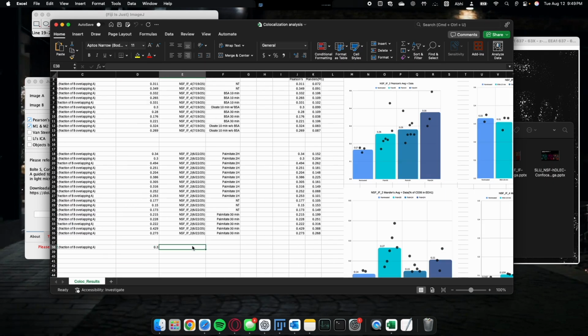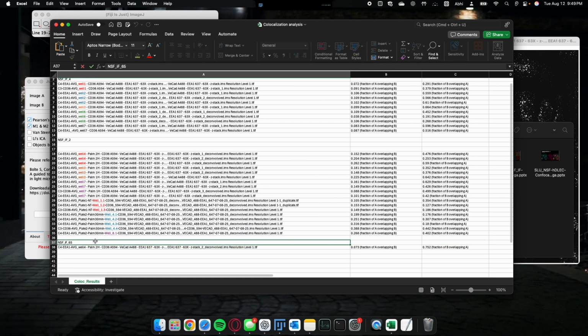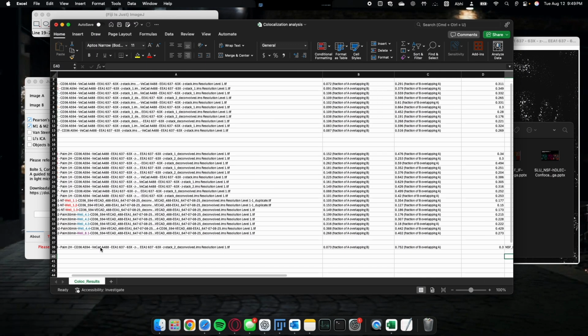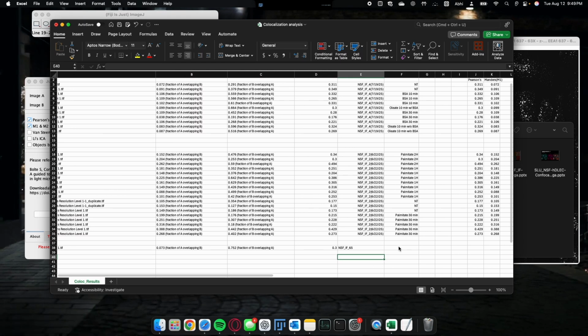And of course, I can add the data, like I wanted to include my name of experiment and stuff like that. There's a whole lot you can do with this. It's up to however you want to organize it and however you want to label your data.